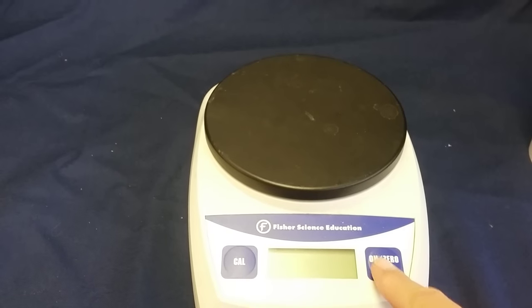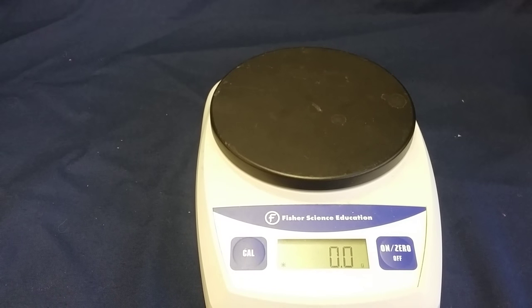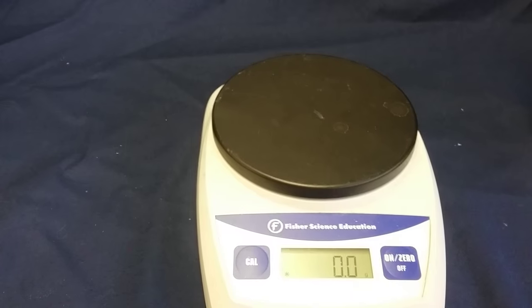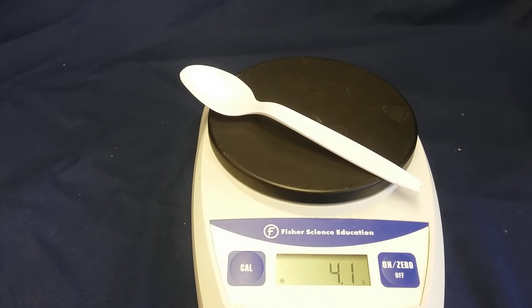When you come to your scale, press the on button and wait until you see a zero. Then place the object that you want to weigh on the tray. The spoon weighs 4.1 grams.